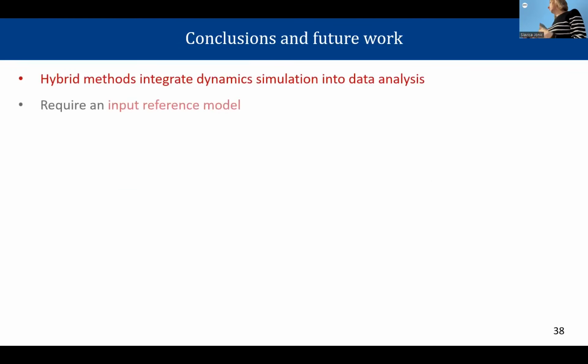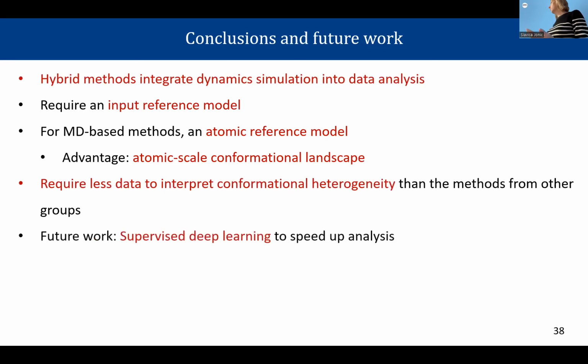Just to conclude, what would be the future work for this kind of approach? The next step would be to extend it and combine it with supervised deep learning in order to make it a little bit faster. You have a big data set, then you analyze a small subset based on, for example, MD space. For this, you can run longer all-atom simulations because it is a very small data set.